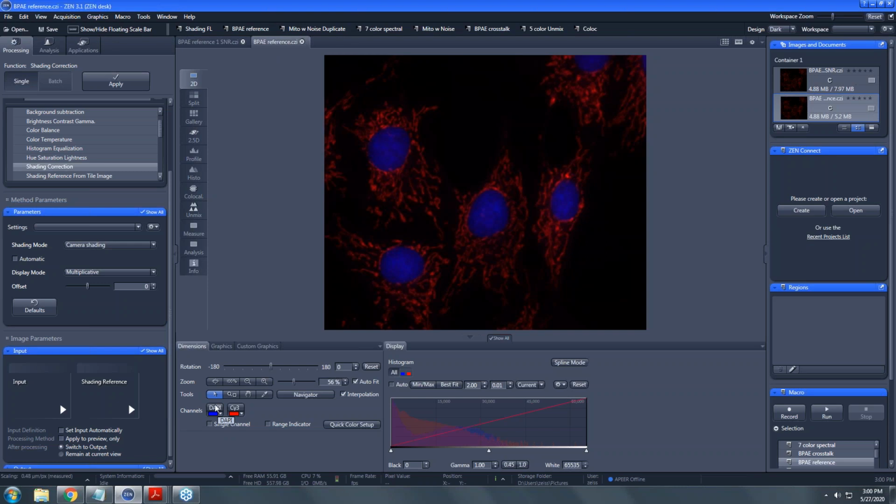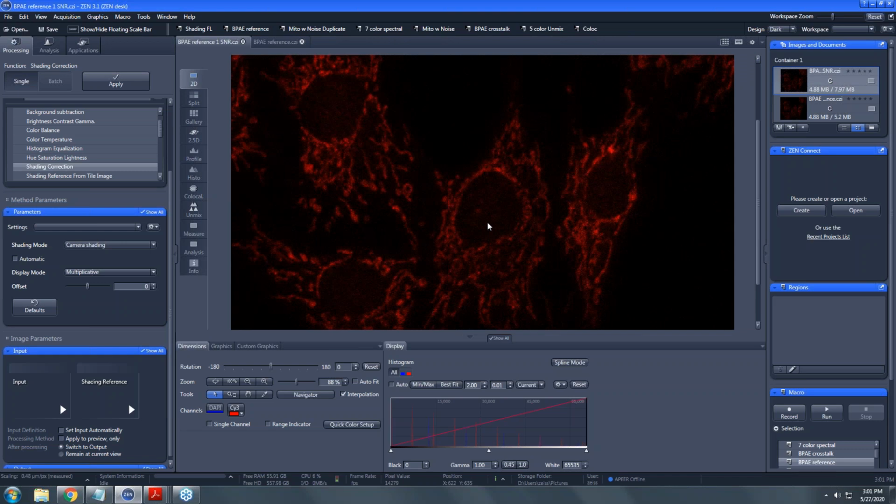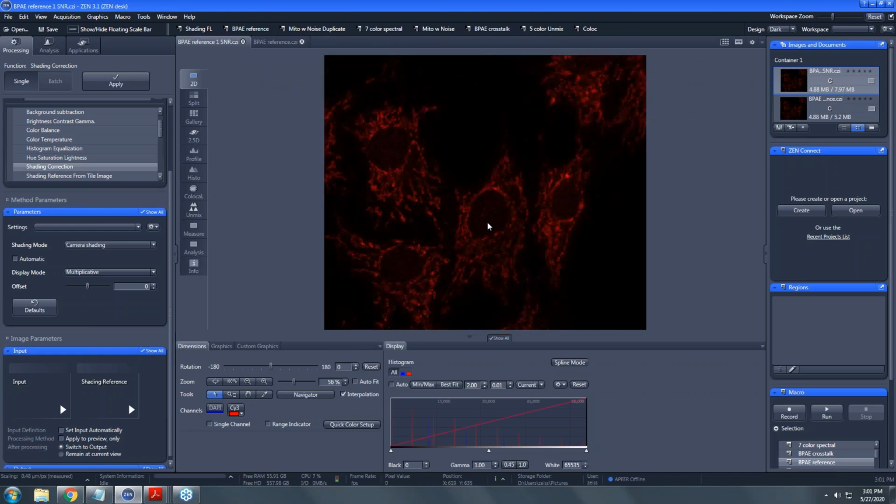Okay. So this is a very nice image, high contrast with the mitochondria, and pretty easy to quantify by regular image analysis. What we're going to do is compare and contrast the classic image analysis versus the machine learning. We're going to step through how the machine learning works, and then we're going to show how machine learning can really give us a big advantage over classic image analysis when we have a poor image. So we've got a second image that Nicole's opened up here, where we've taken that really nice image and added noise to it, so that we have a rather poor signal to noise. The contrast is down, and we're going to see how the classic image analysis and the machine learning perform compared to each other.